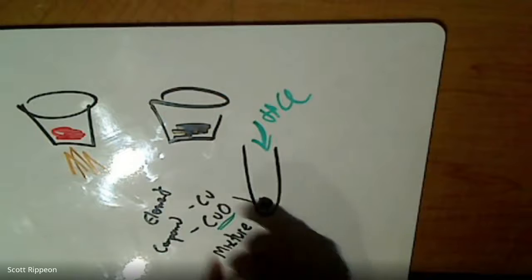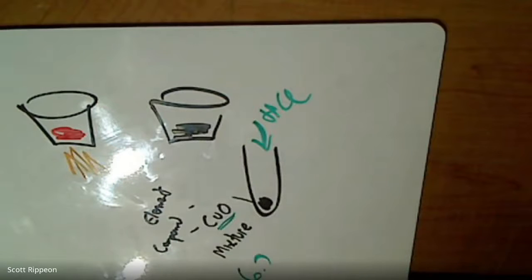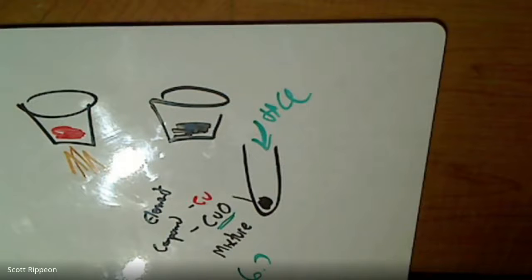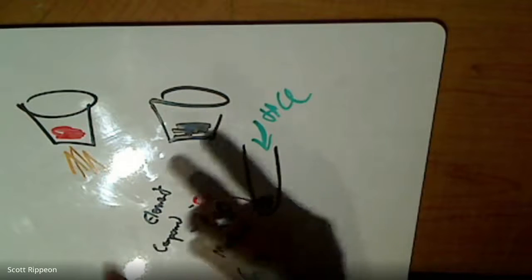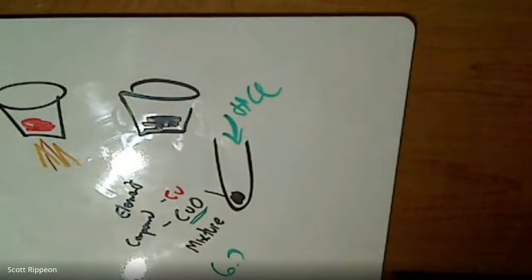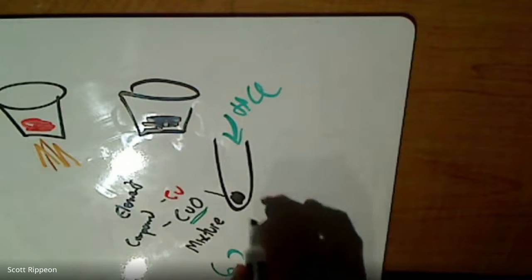Now, some of you said that it might not be any copper left in there, and we'll find out. If you see copper when you're done, you know it came back, and it didn't react. And that's lab 6.7. Now, the next piece, lab 7.1: we're going to take the solution that's made.